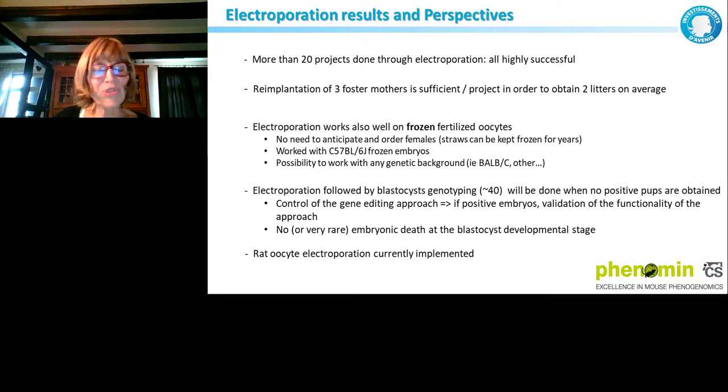What is also very nice with electroporation is that we can just buy fertilized oocytes from Janvier, for instance, in France. We can get them, and then we can just electroporate these fertilized oocytes without having to breed animals and so on. That's really, really convenient. Also, if you don't have too many projects, you can just thaw straws and work on this one. And of course, it opens the field.